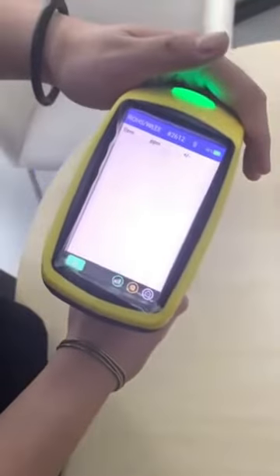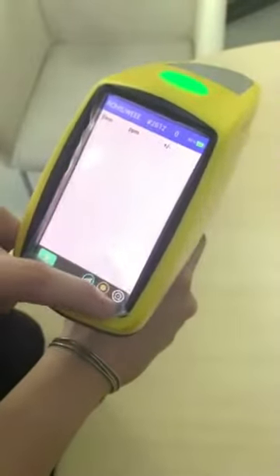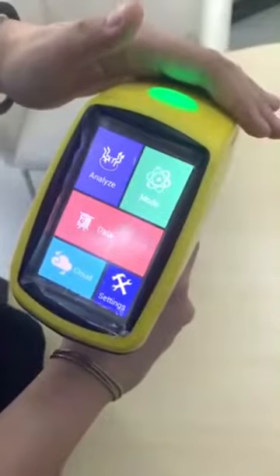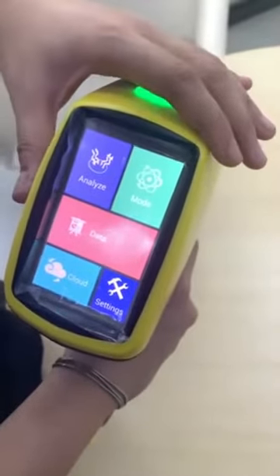This is the test interface of our instrument. We press the home button and now you can see we have changed to the home interface.